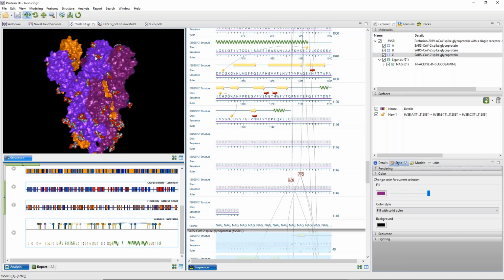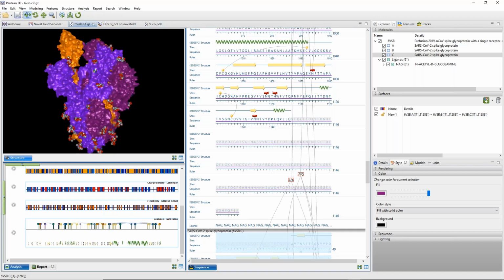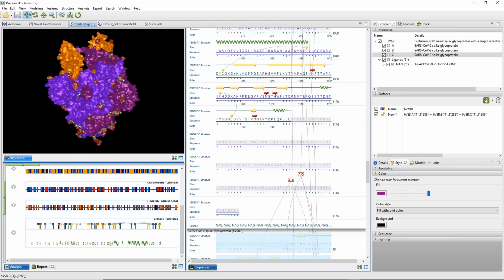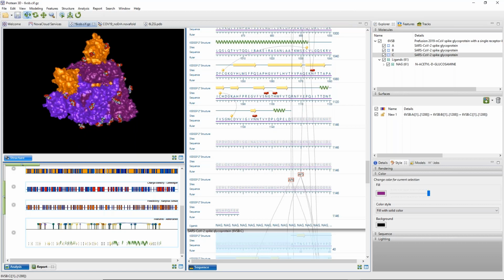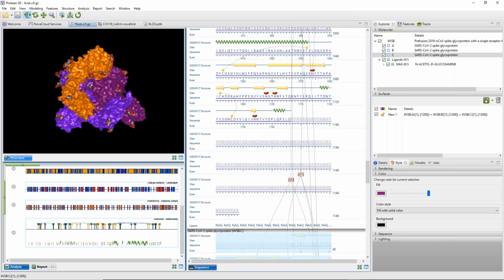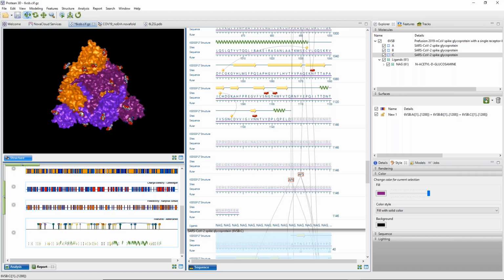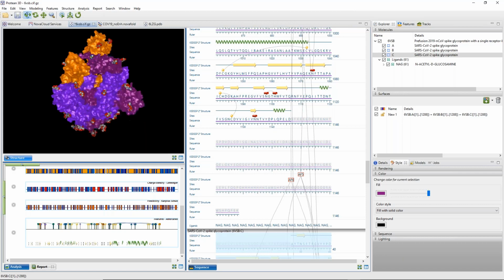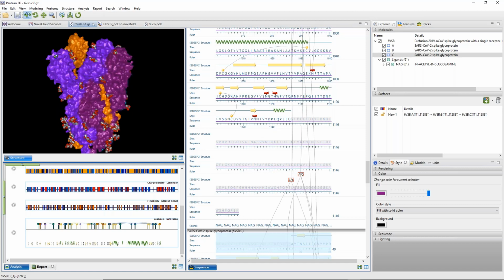And so this is the trimer, and now we can see it in better detail, and we can see its symmetry, which is interesting. Now, also, we are looking down on it, actually. If you imagine, this is sticking out of the top of the nucleocapsid, I believe. So this is sticking up. And so it looks kind of like an upside down pyramid if we look at it that way.